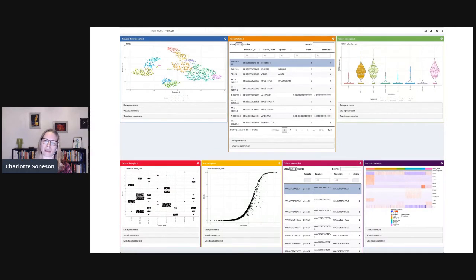There is an add-on package, iSEEu, which provides additional panels. And you can easily create your own panels if you want to perform specific analysis or make specific visualizations. The basic iSEE panels don't actually perform the analysis internally, let's say. They don't run the PCA or run the clustering, but rather visualize the data or the information that's stored in the input object. It's totally possible to build panels that perform analysis, but having the basic ones just visualize the data that's in the object has some advantages.